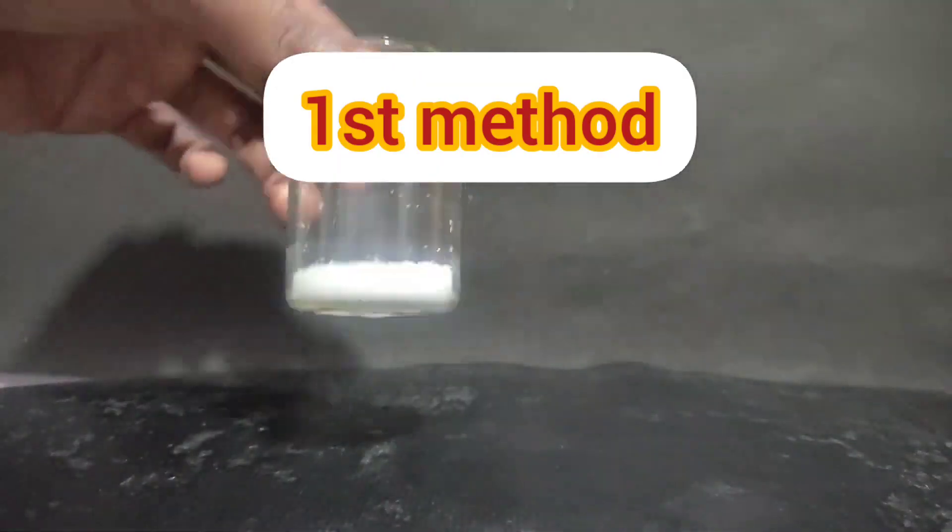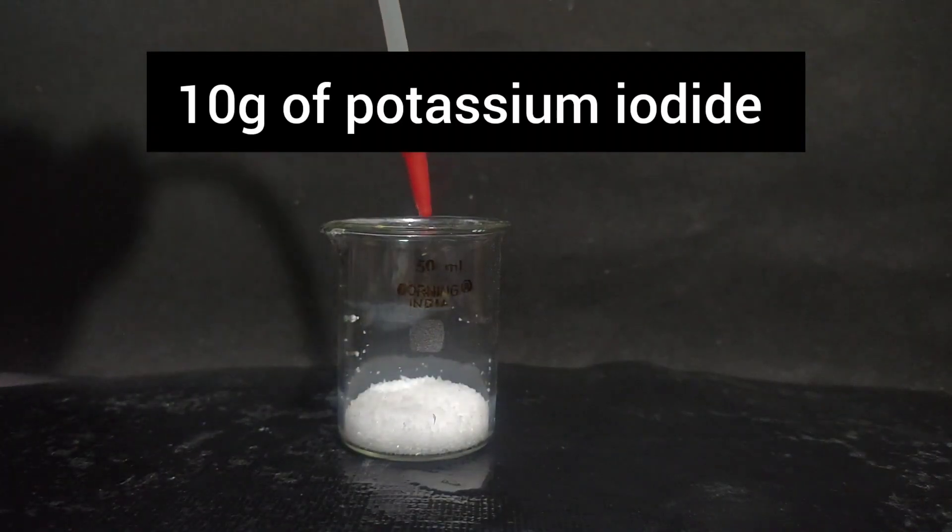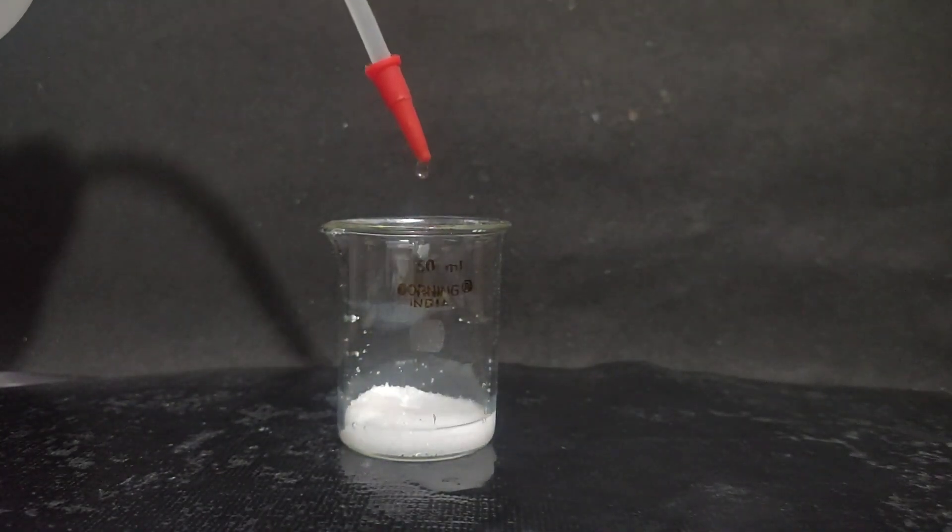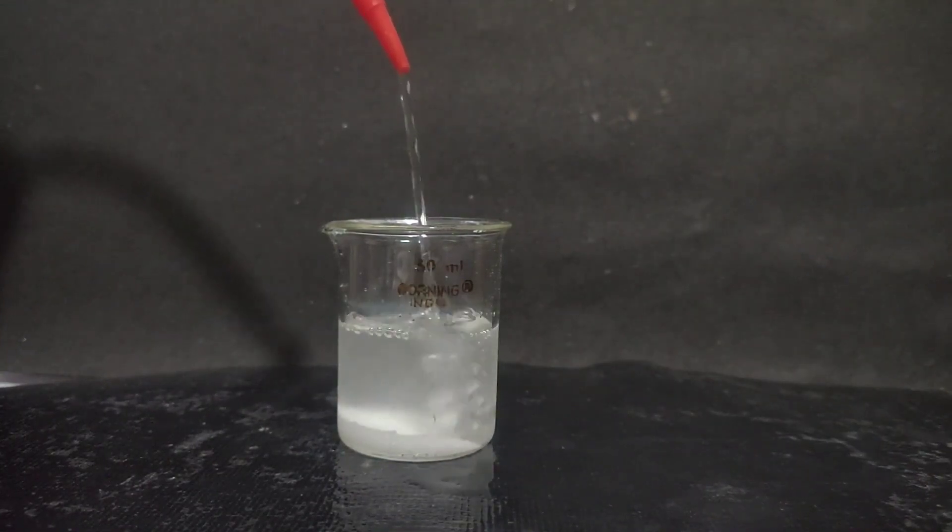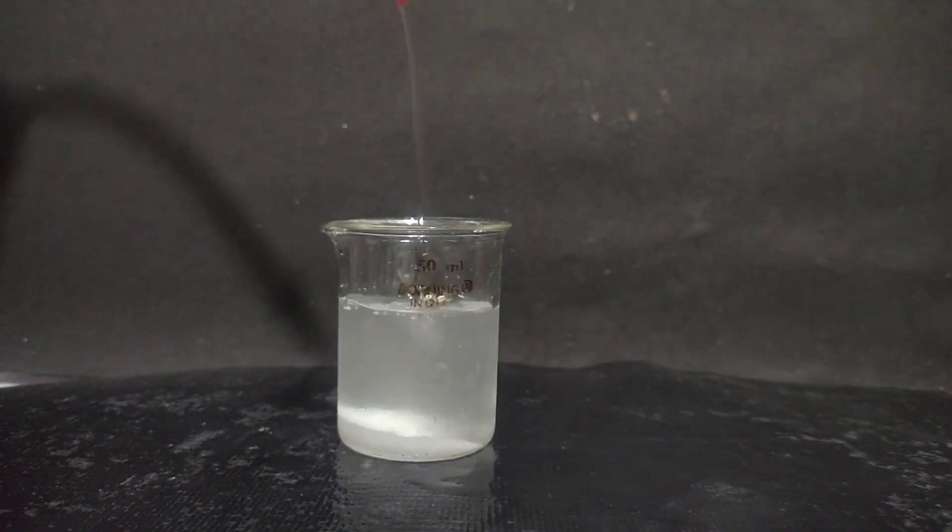To start things off, I took 10 grams of potassium iodide in a 50ml beaker and added 30-40ml distilled water to it. Potassium iodide has a high solubility, so everything dissolves quickly.